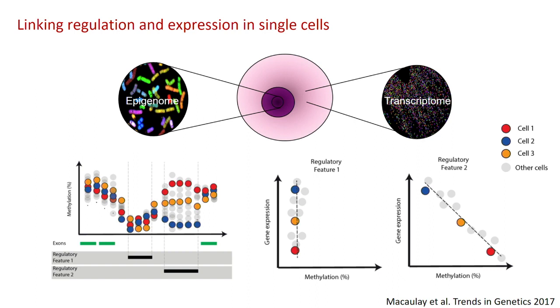But a lot of developments at this point had happened in terms of tools for single cell profiling of single cell epigenomes. So with Wolf Reik's group, we started looking at using their single cell bisulfite sequencing approaches on the DNA that we purified using the G&T-seq method. Because as you remember, we just have DNA sitting on beads in a tube. We can pretty much do any enzymatic treatment that we would want to.